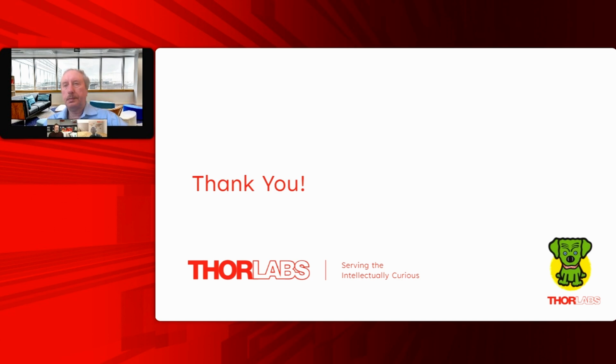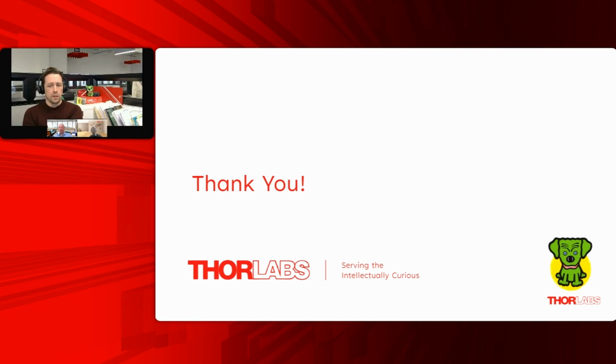A couple multi-parters for you, Feng, on the QCLs. The first is using the supercontinuum. So this is going to tie to the QCLs, trust me. Is using a supercontinuum similar to using a frequency comb? And I know you have some expertise here. So do you also have any comment on what comb characteristics are important and how that fits into the greater QCL landscape?